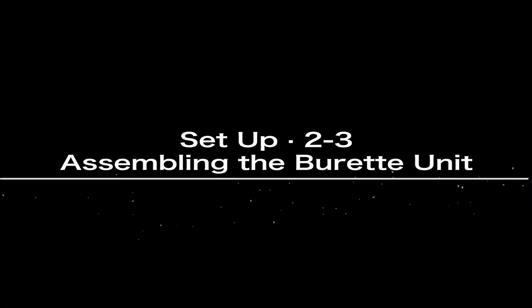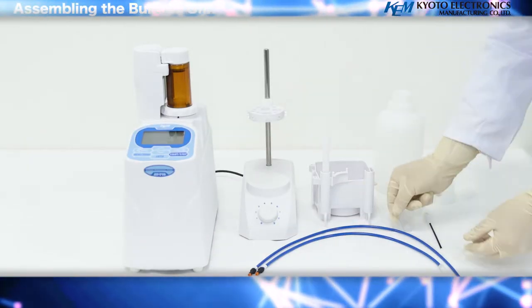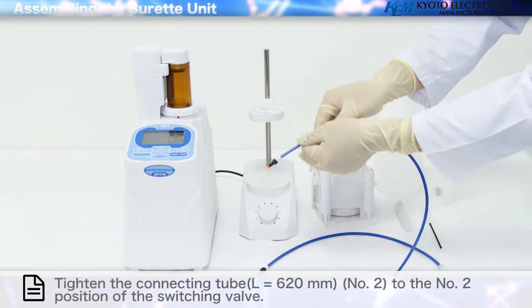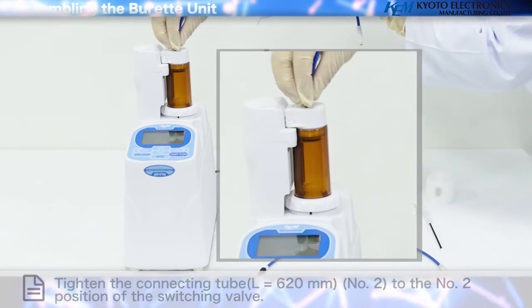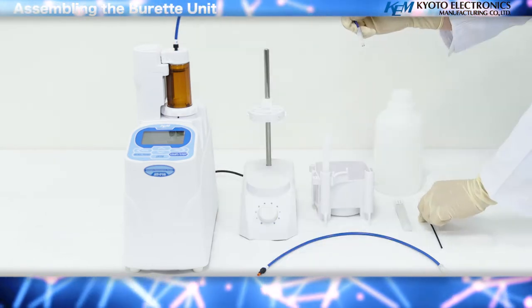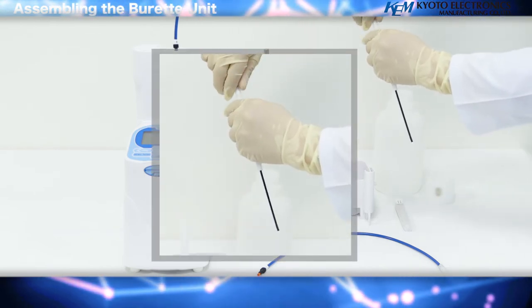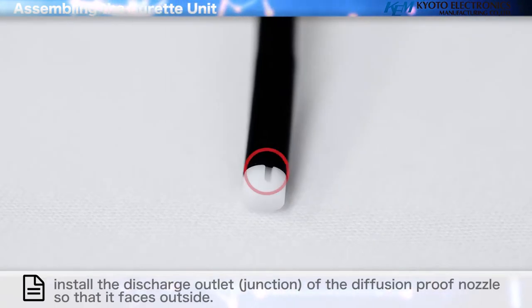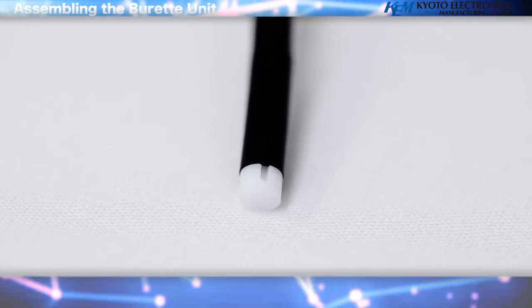Assembling the Burette Unit tubing: install the nozzle pocket to the base of the bottle. Tighten the connecting tube to the number two position of the switching valve. Tighten the diffusion proof nozzle to the tip on the reverse side of the connecting tube and attach it to the electrode holder. Install the discharge outlet junction of the diffusion proof nozzle so that it faces outside.